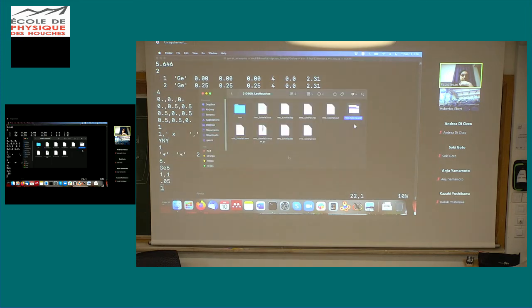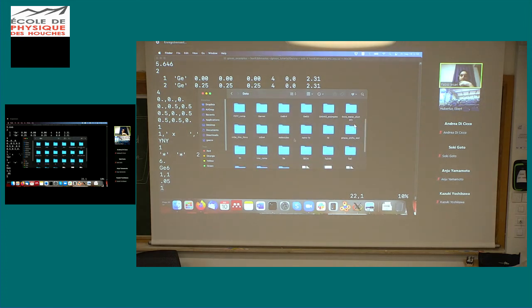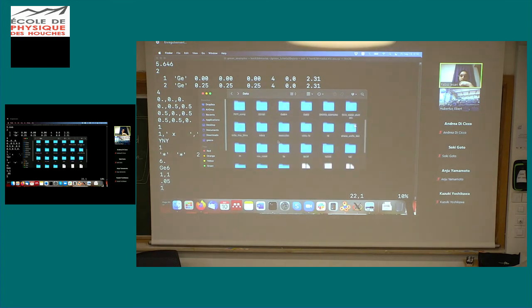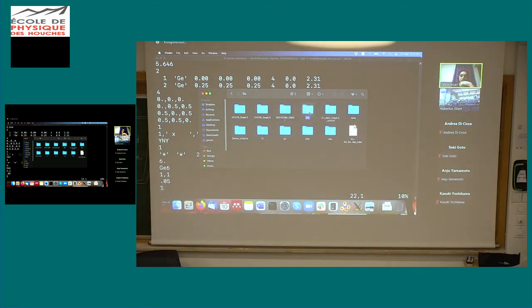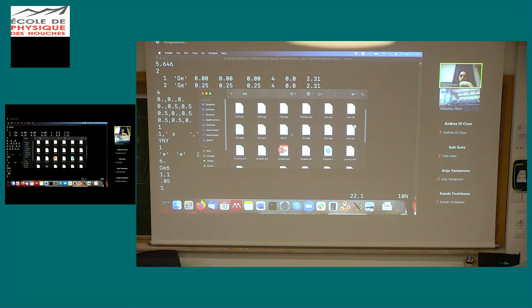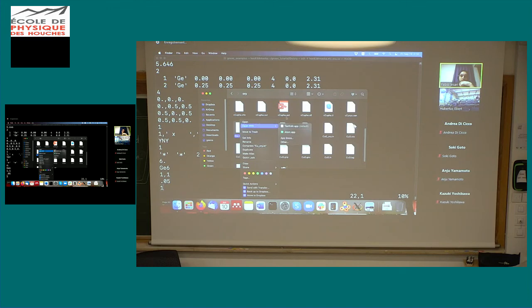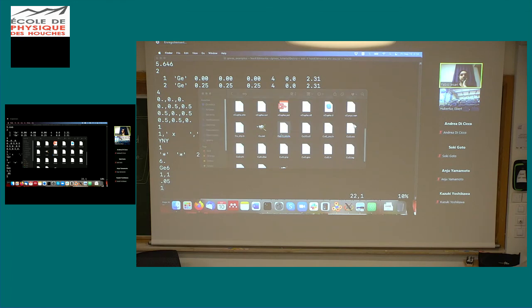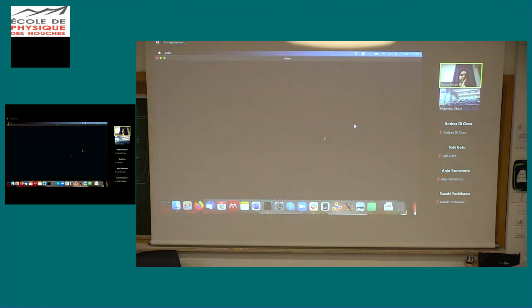So let me look for, maybe I can show. For example, I will show you the input file for copper oxide.